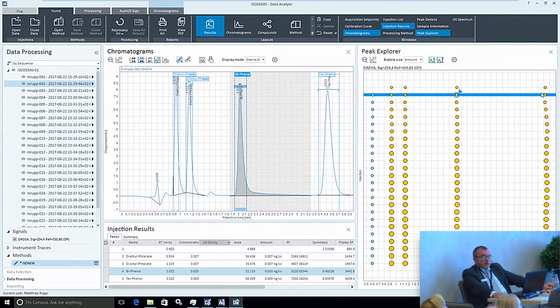What else do I see in one view? Bad chromatography. The retention times are not stable for this calibrated compound.